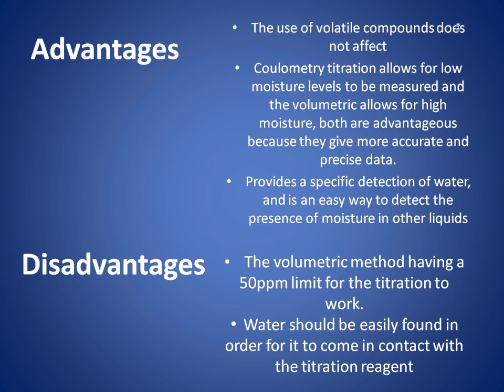Other precautions include avoiding unintentional water, such as water in the instrument and the sample. Also, the sample should be titrated but not over-titrated, and should be fully dissolved in order to obtain usable data. Conductivity is important in coulometry.